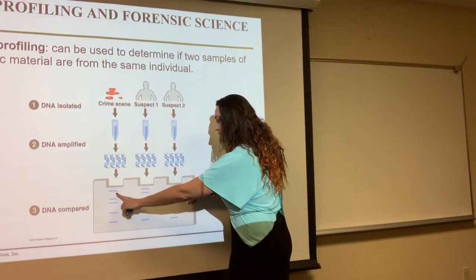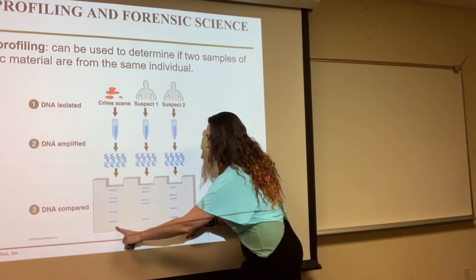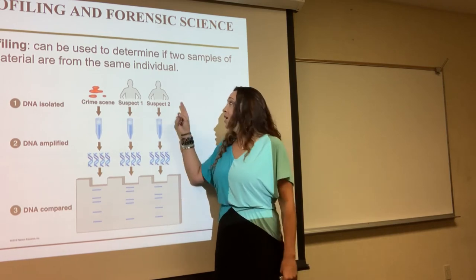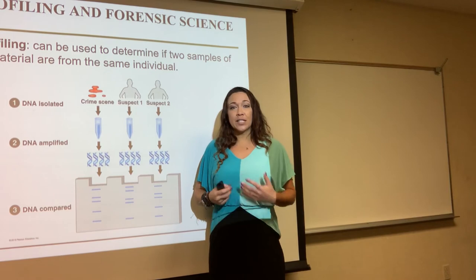Suspect two. This one matches up. Oh, that one matches up. That one matches up. Oh, that one matches up. And this one matches up. Every single one of these little tiny segments matches up, which means, sorry, suspect two, but you are the criminal. You did it.